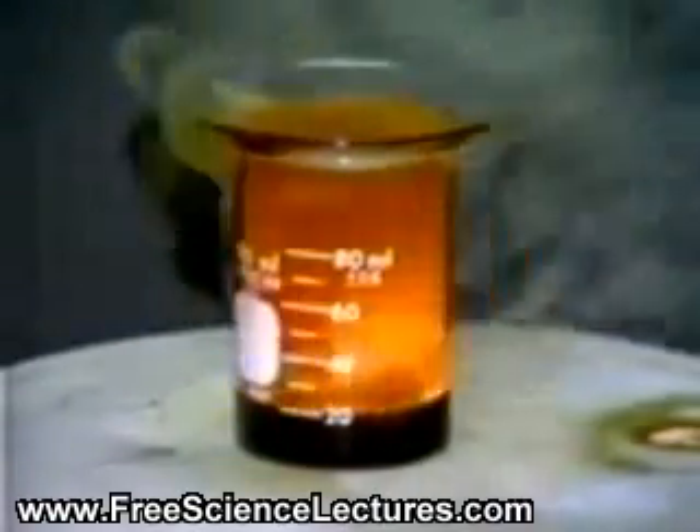Here we see the aluminum pellets burning with a bright flame. We also see white fumes of aluminum bromide, a solid which coats the watch glass and escapes from the beaker.